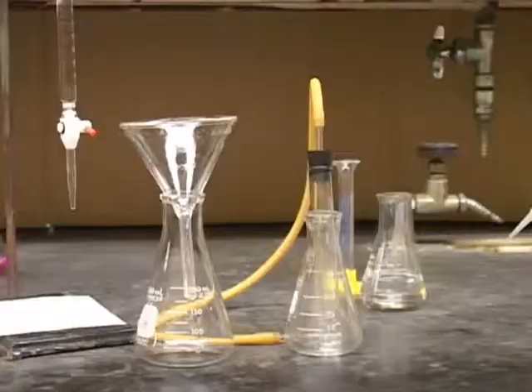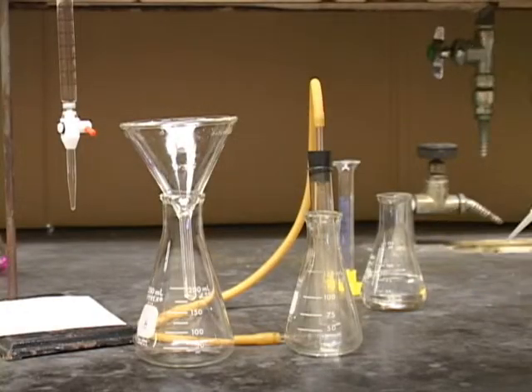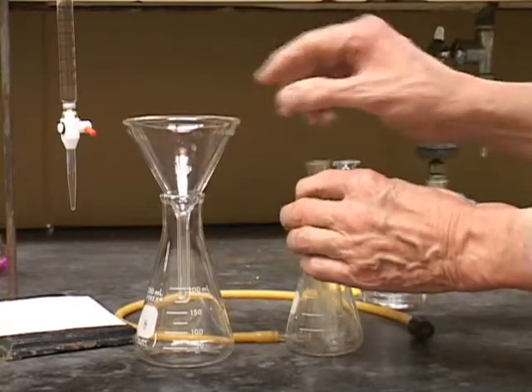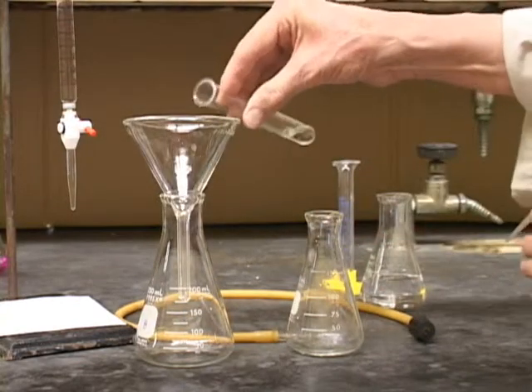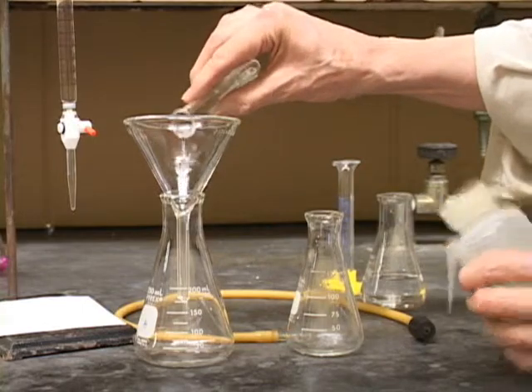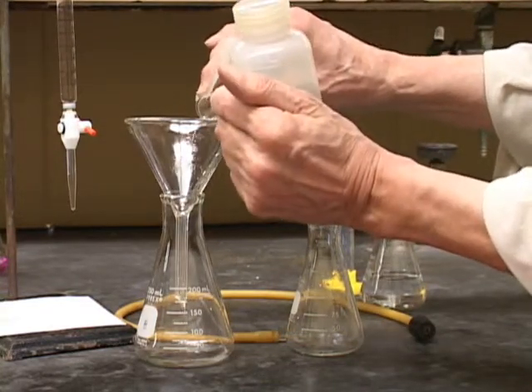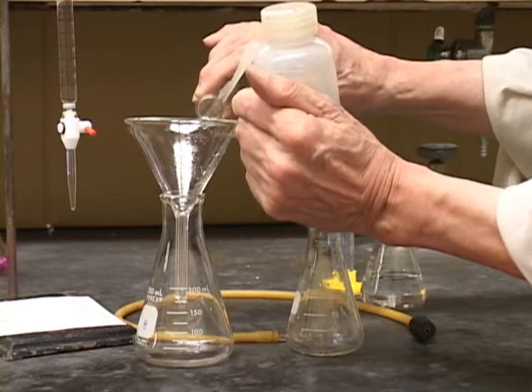To determine equivalence by titration, you will quantitatively transfer the reaction solution with its remaining HCl to the titration flask. Use your funnel and wash bottle to make sure all of the contents of the tube are transferred to the titration flask.